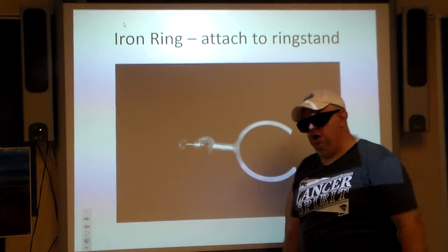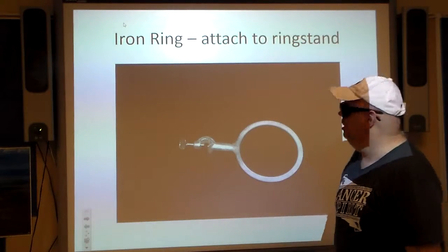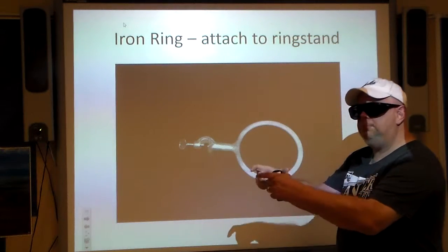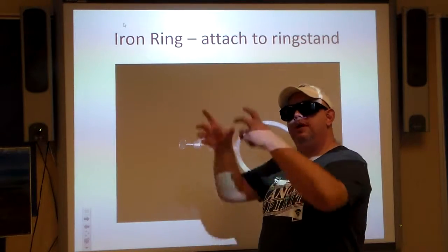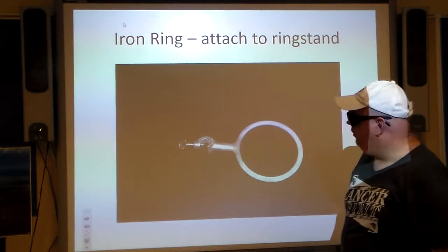Iron ring — it's a distant relative of Iron Man. The iron ring is something we attach to the ring stand, and it forms a little platform where we can place the wire gauze, put a beaker on top, and set up a heating apparatus for chemistry experiments. It's very useful.